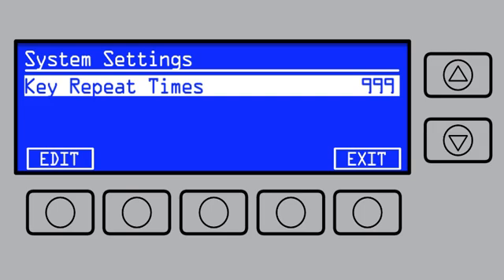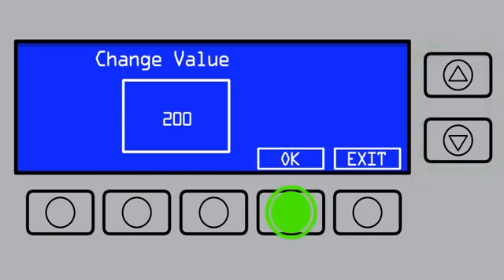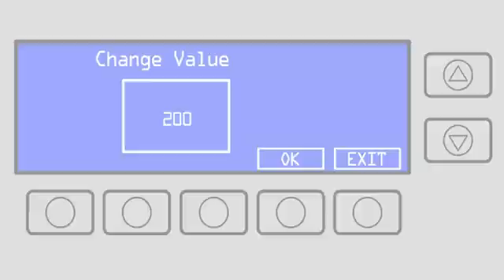To set any of these options, use the up and down arrows to highlight, and then press Edit to access the editing screen. Use the up and down arrows to set your value. Press OK to save, then exit to return to the main menu.